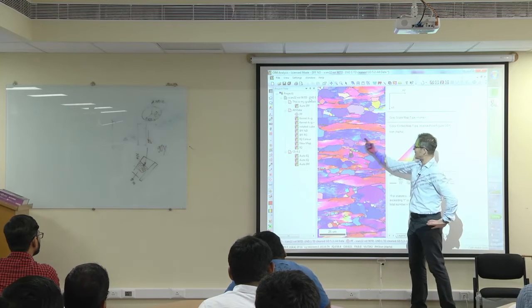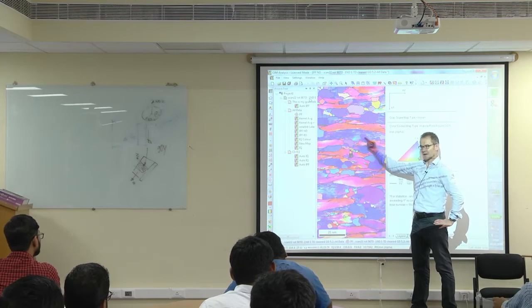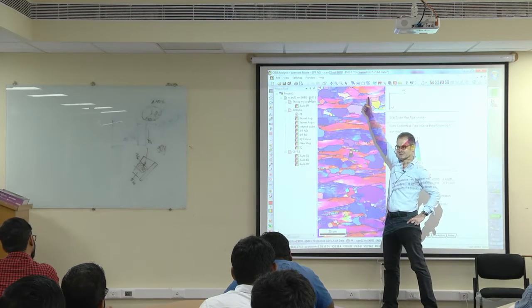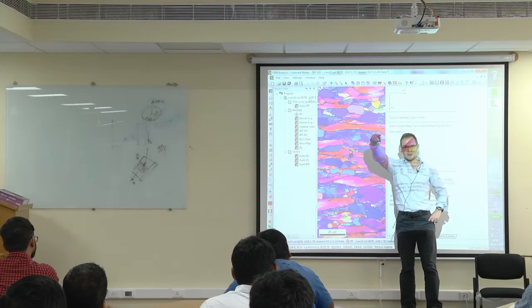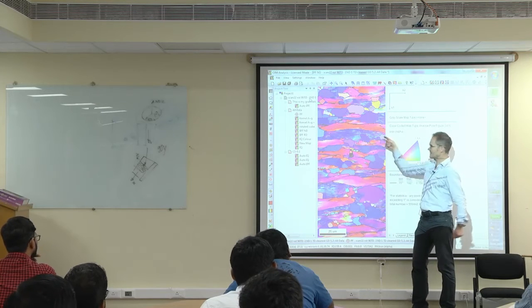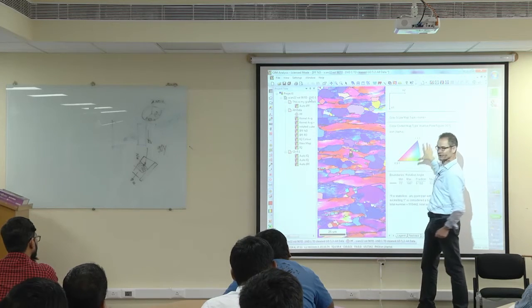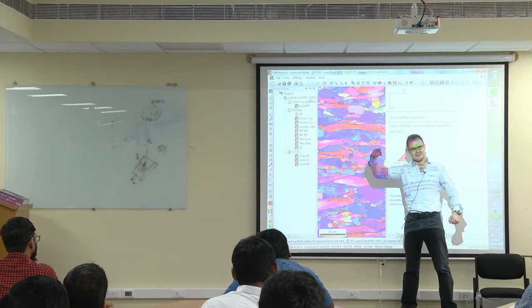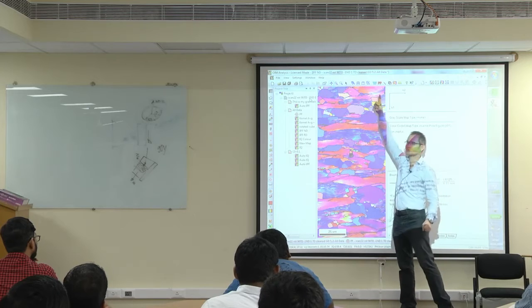And that means if I click on one grain here, and this grain is actually pointing with 111 in this direction, it will look here as if it points towards us. Yeah? The color indicates that, is good. And the orientation, this grain which I have plotted here, also indicates it. But the grain is not pointing towards us. It has been rotated, it points towards up.